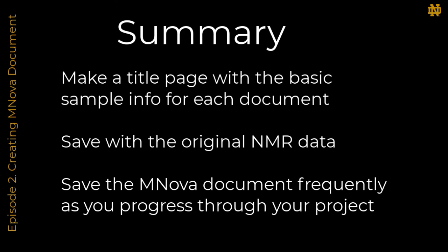In summary, make a title page with basic sample info for each document. Save the document with the original NMR data. Save the MNova document frequently as you progress in your project to prevent data loss.